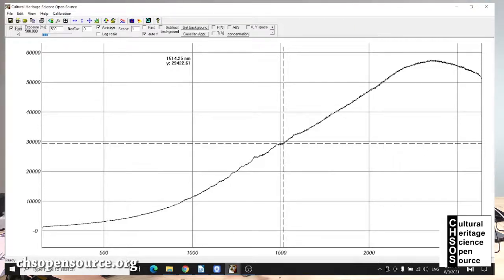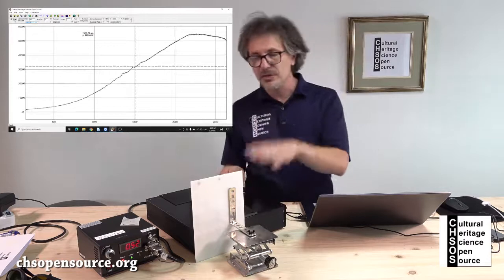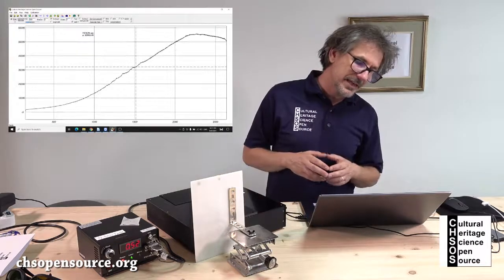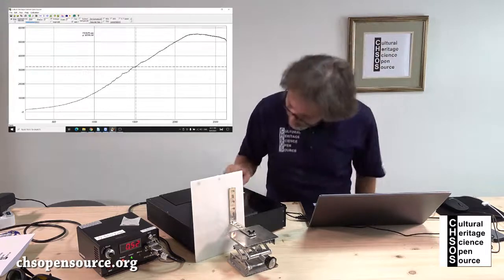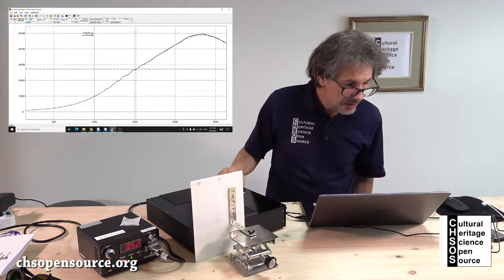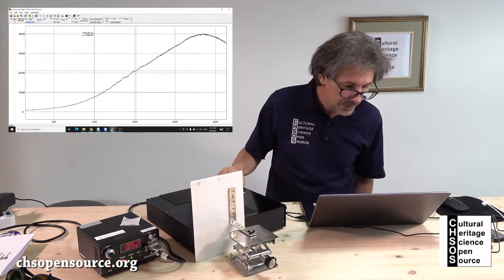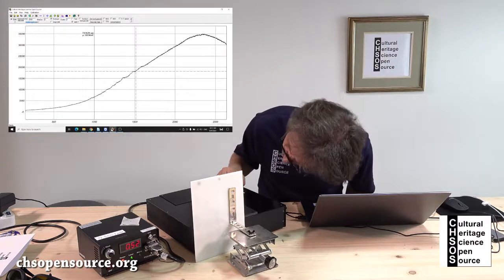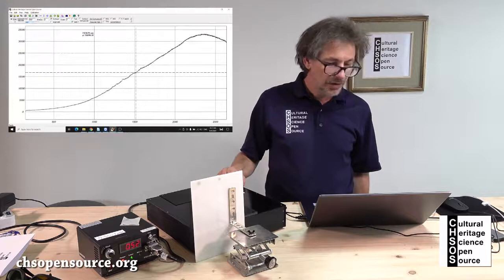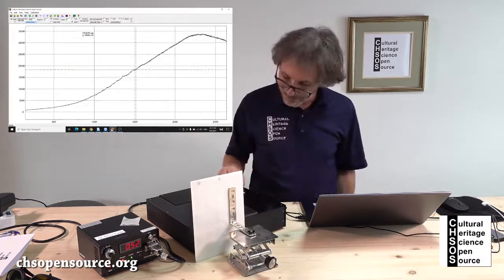Okay, so in this case, this is the acquisition you would do when you use the spectrometer as it is received. So my idea now is, let's see if I can get a little bit better. So I close the slit a little bit more. Okay, so for example, from 2x I go to 1x.